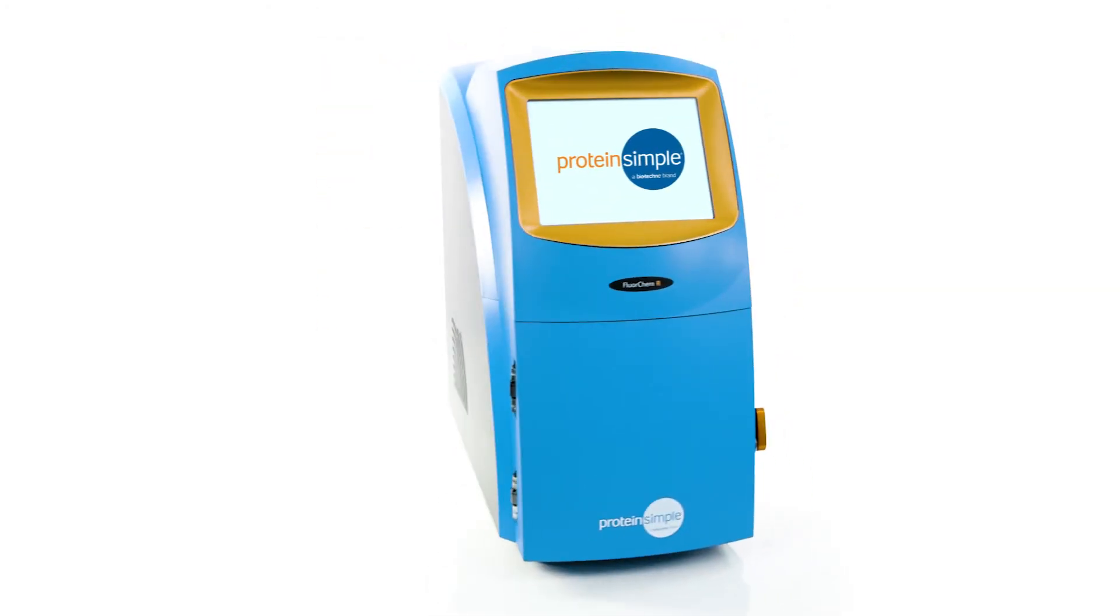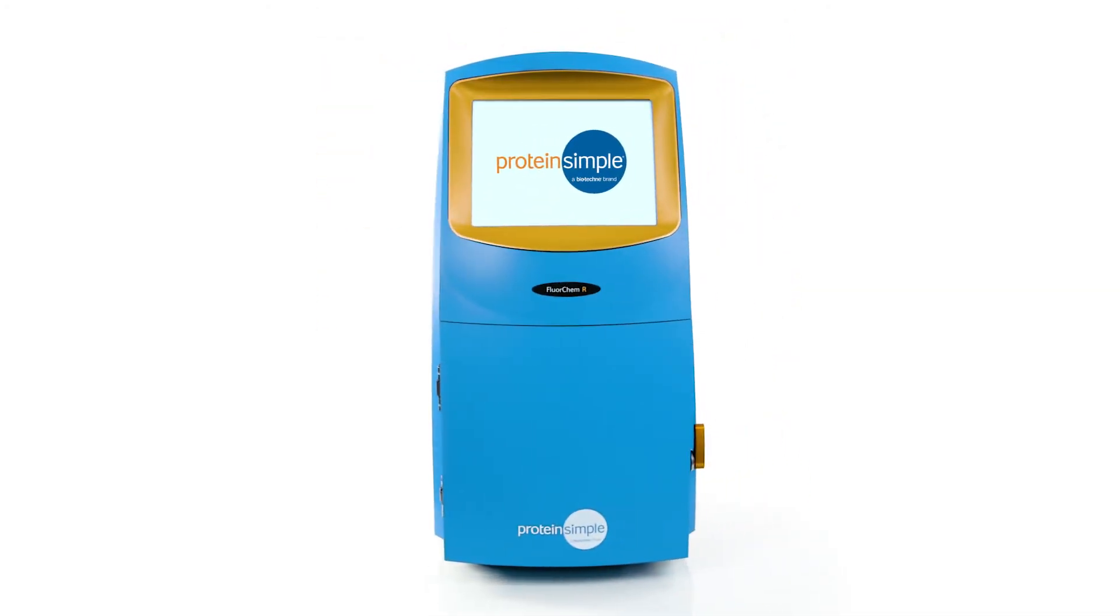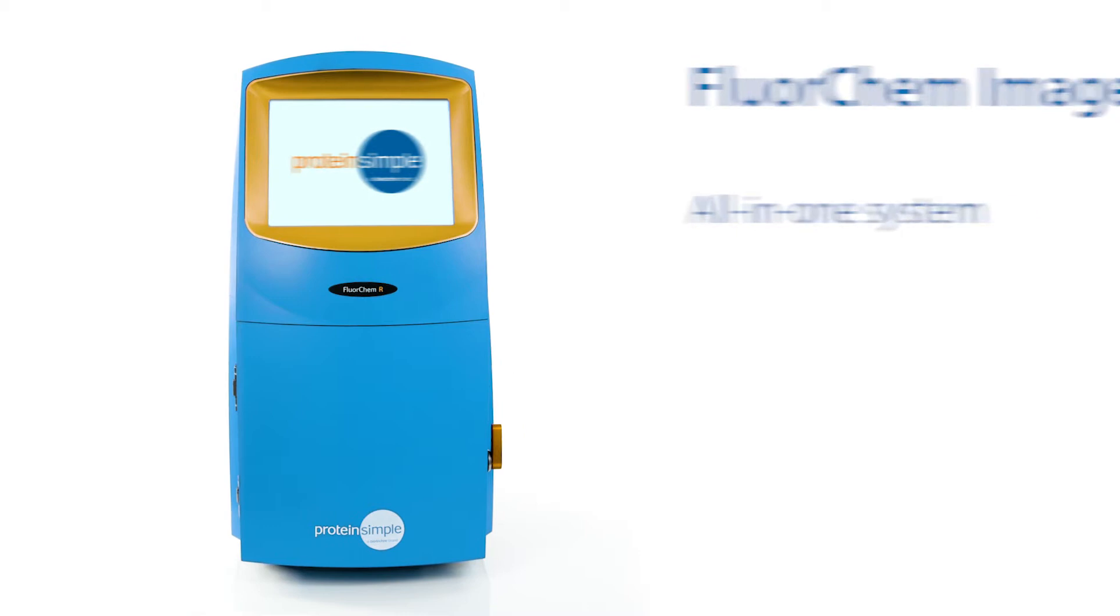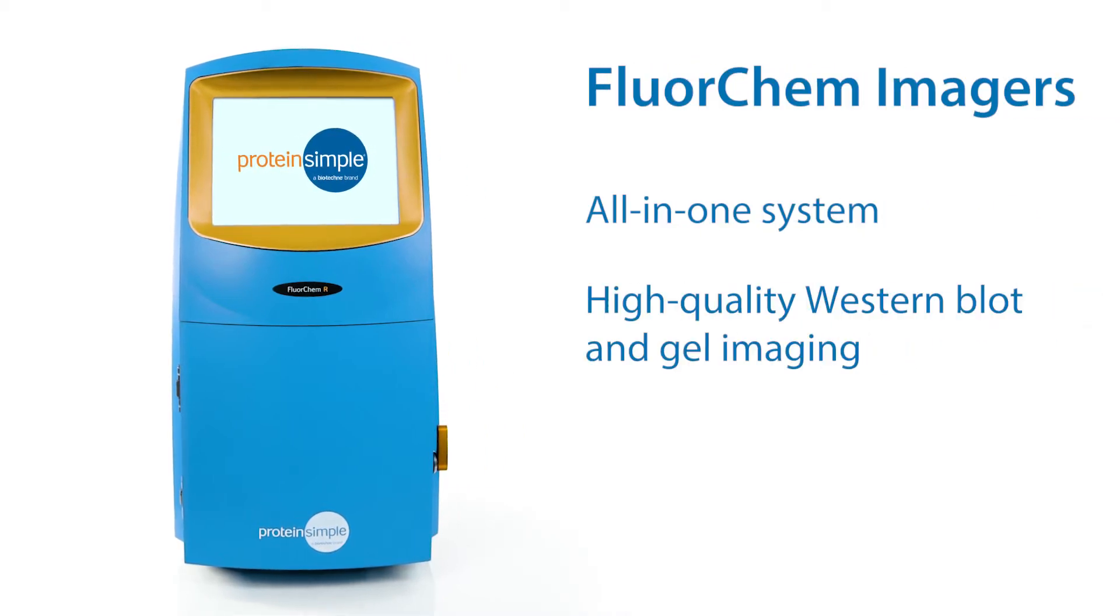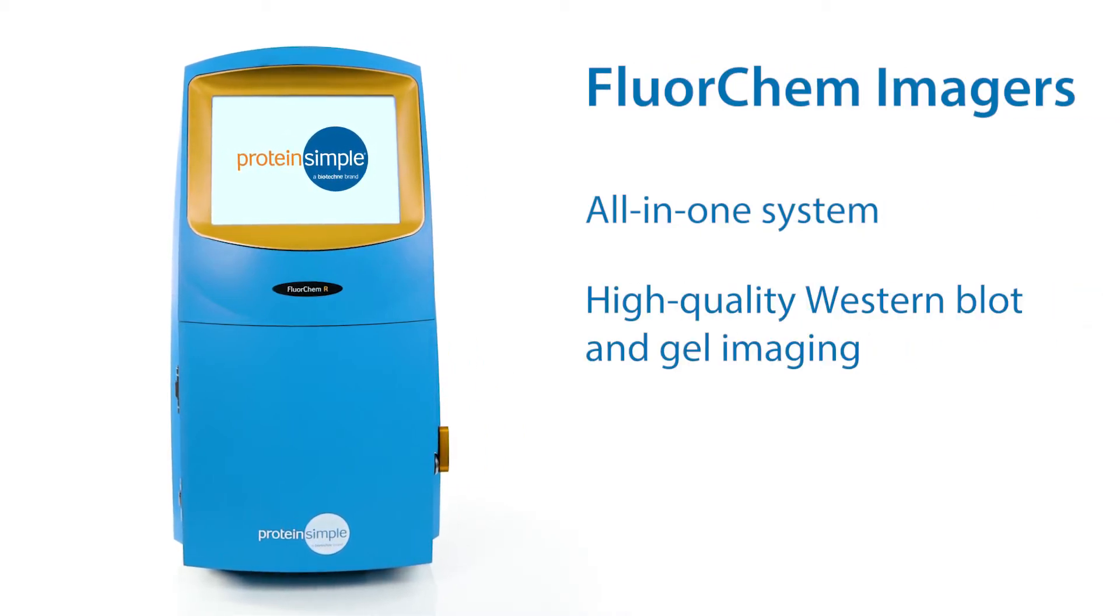FluorChem Standalone Imagers are an all-in-one system designed for high-quality Western blot and gel imaging.